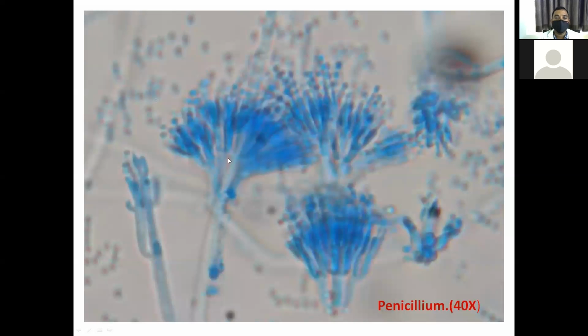This one is Penicillium in 40x high power. This one also has the same conidia, with a brush border like appearance. Here you see very clearly, it is not flower like. See, this one is Penicillium, as you will see in microscopical examination.